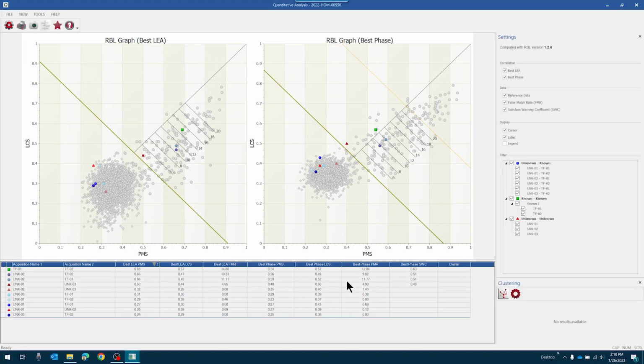Okay, so picking up where we left off from the last episode, we see all of our results here from all the possible correlation combinations of each of the items that were within that workspace. And what I want to show you now is a tool that is called clustering. Let's move this up a little bit. And I'm going to press this button to calculate the clusters.